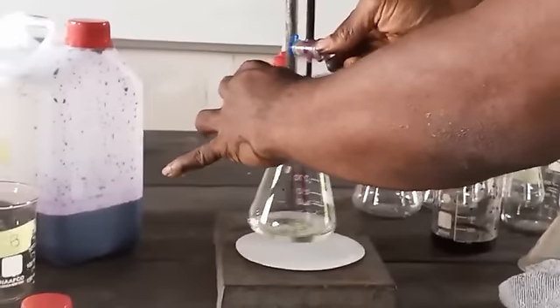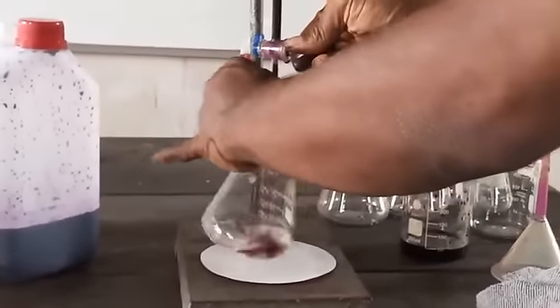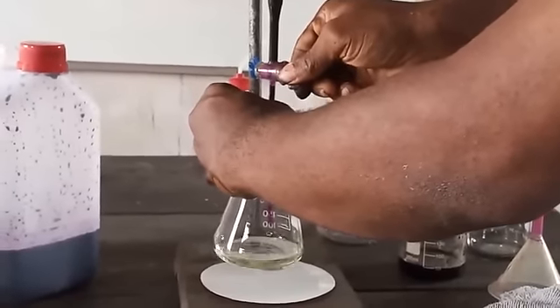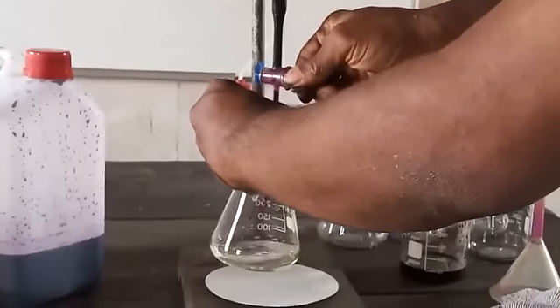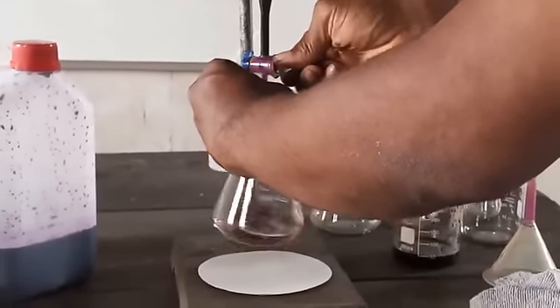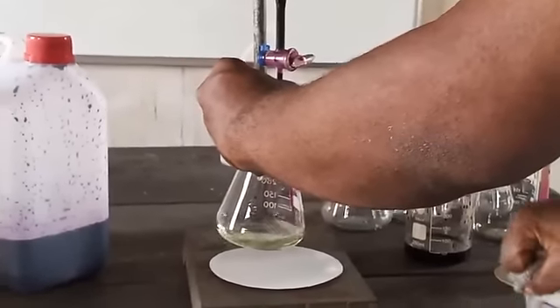For now, you cannot say where the color will change, so you go drop by drop, taking it one drop at a time.